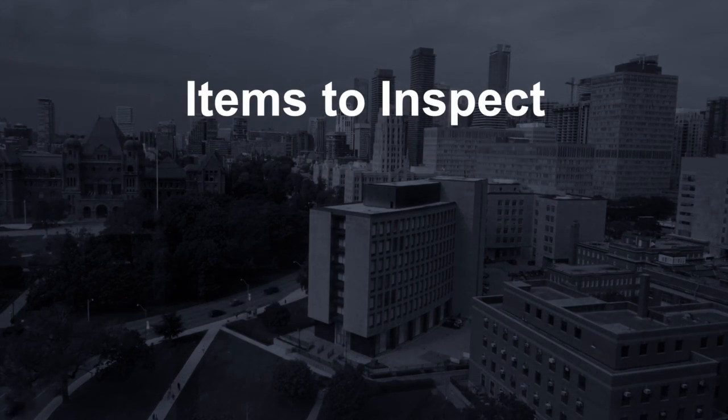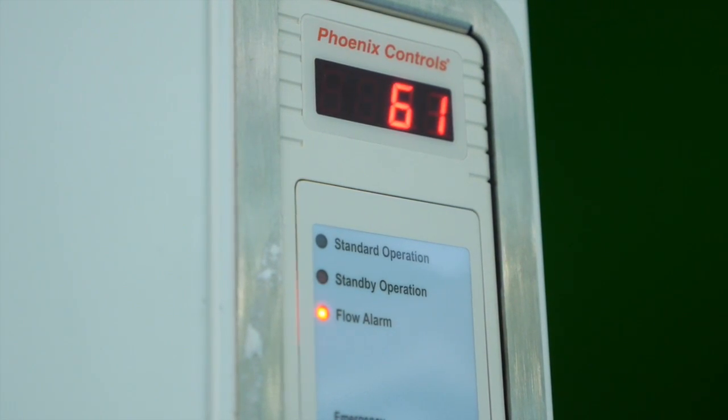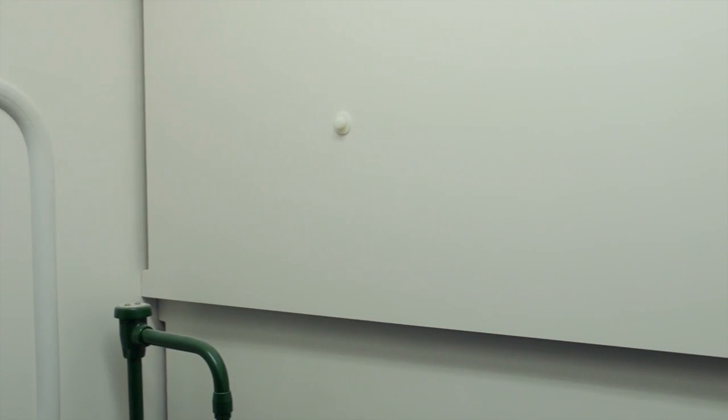Items to inspect include exhaust fan. Ensure the exhaust fan is functional before starting your work. Baffles. Check the baffle slots are free of obstruction.